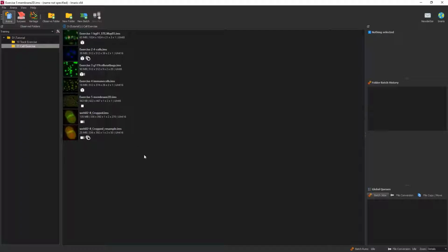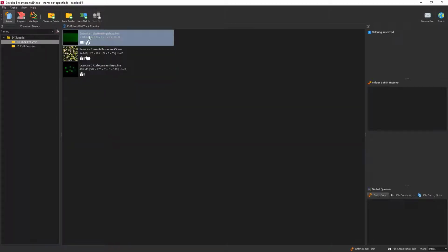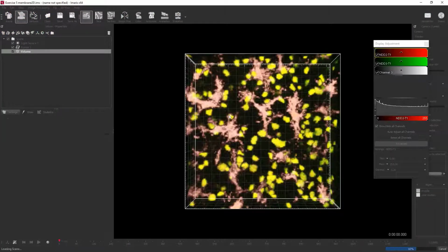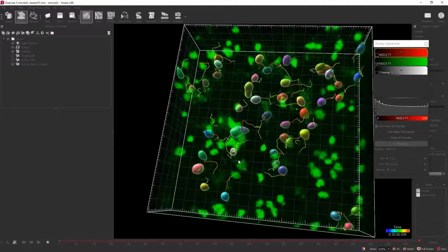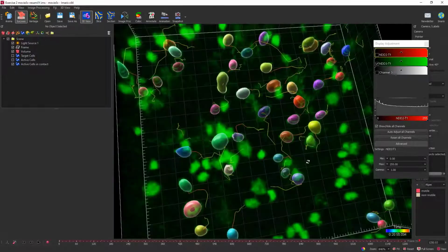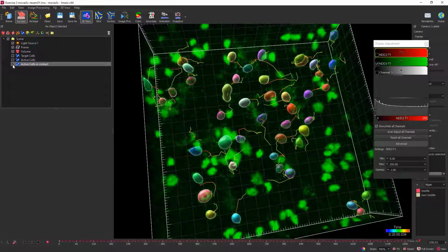Okay, so let's see. Orly had another question, and it was, if you go through and you have to do some manual editing, and you showed us how to do that manual editing, is it still possible to get that shortest distance calculation and to do the filtering? Is that still something that's possible? So I'll answer that question.